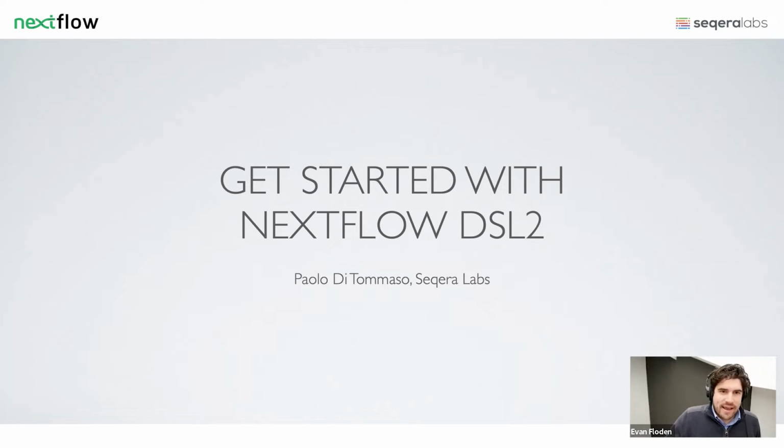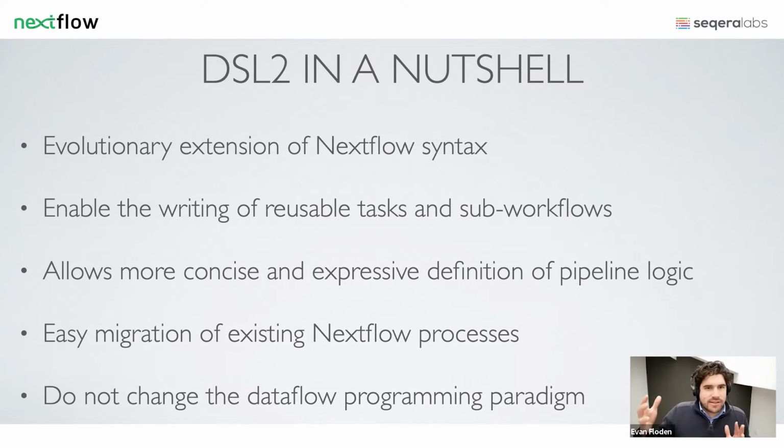And as people start to scale this out to many different steps, sometimes 50, 60, 70 steps, it just becomes unmanageable having this in a single big file. So in a nutshell, it's really an evolution of the syntax itself. It allows you to write those tasks in a reusable way. It also allows you to do workflows which call workflows. So you can have workflows inside of workflows, which means that you can have what we call sub-workflows. And this makes it very powerful in terms of being able to combine things together as well.